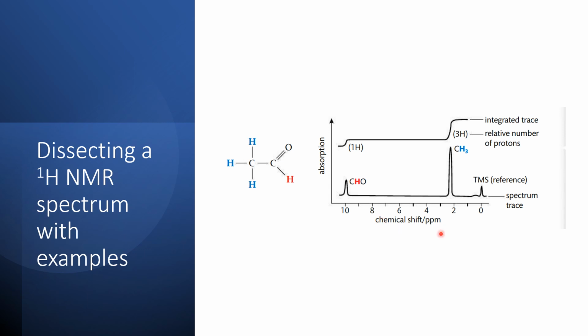I can also see that depending on what the hydrogen is connected to, it'll either be downfield, which is that way, or upfield, which is that way. Downfield means that there's not a lot of shielding because it's close to an electronegative element, which means the electrons are closer to the more electronegative element. That's why it's called downfield. Or it's going to be upfield, which means that it's close to an element that is not so electronegative like carbon, and that's going to be closer to the 0. Okay? So I can easily relate these peaks to my molecule. So here, if I have 1 hydrogen, that's easy. This is this hydrogen here. And if I have 3 hydrogens, then this is easy also because that means that it's related to this hydrogen here.